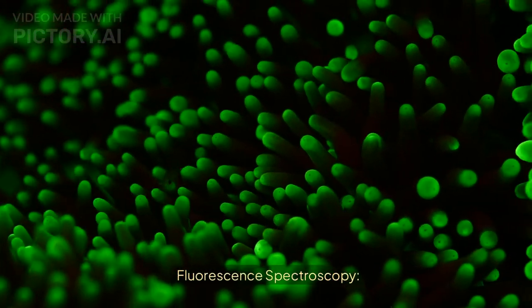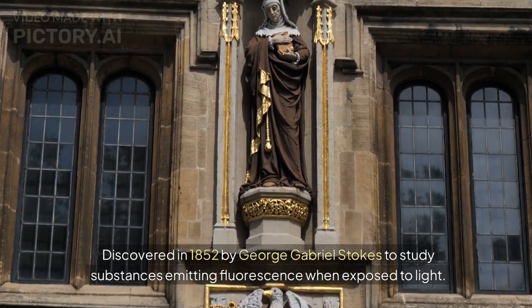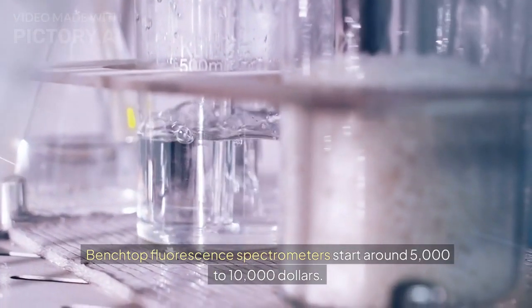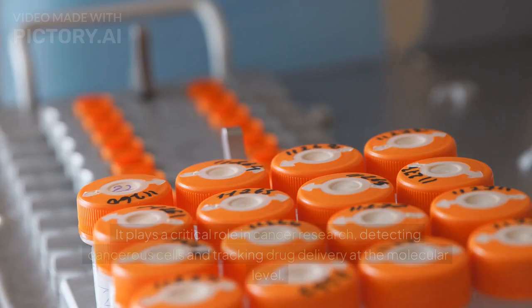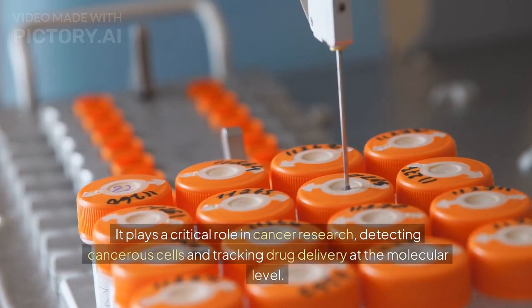Fluorescence spectroscopy. Discovered in 1852 by George Gabriel Stokes to study substances emitting fluorescence when exposed to light. Benchtop fluorescence spectrometers start around $5,000 to $10,000. It plays a critical role in cancer research, detecting cancerous cells and tracking drug delivery at the molecular level.